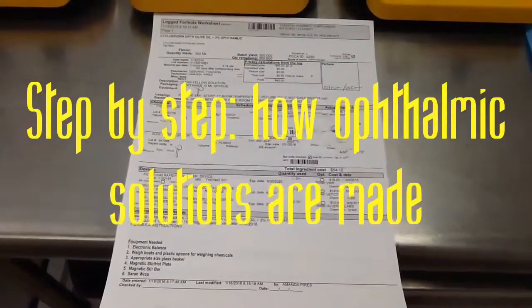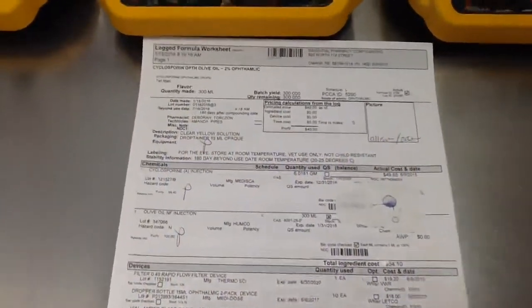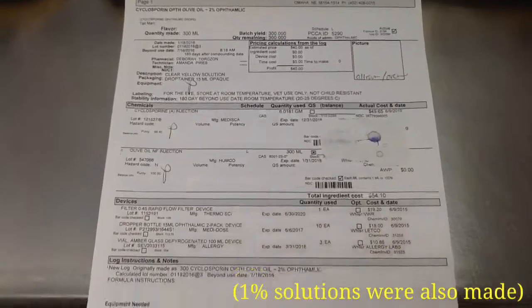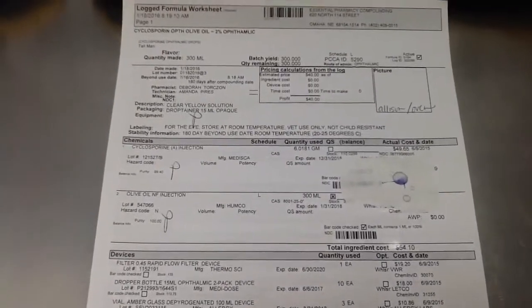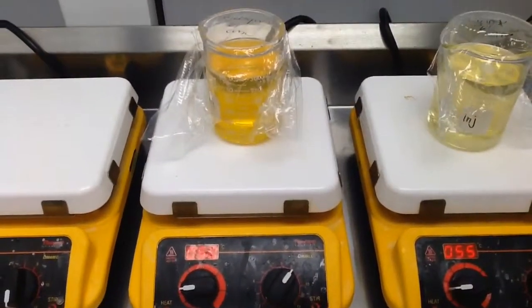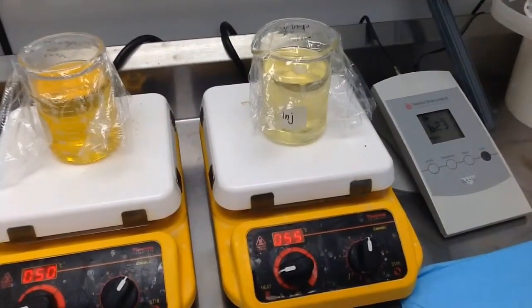So today we're going to make some Cyclosporine Ophthalmic eye drops with olive oil, 2%. And this is the formula, which I'm sure you've become really familiar with by now. We've already weighed out the cyclosporine and QS'd it with olive oil. We are making a corn oil and an olive oil.